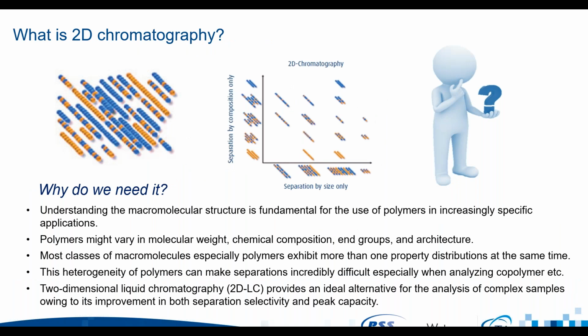So I hope, based on the poll results, that I've not gone too far too fast. So we now know that SEC or GPC is a generally accepted polymer separation technique that gives us a molecular weight distribution in its very basic terms.